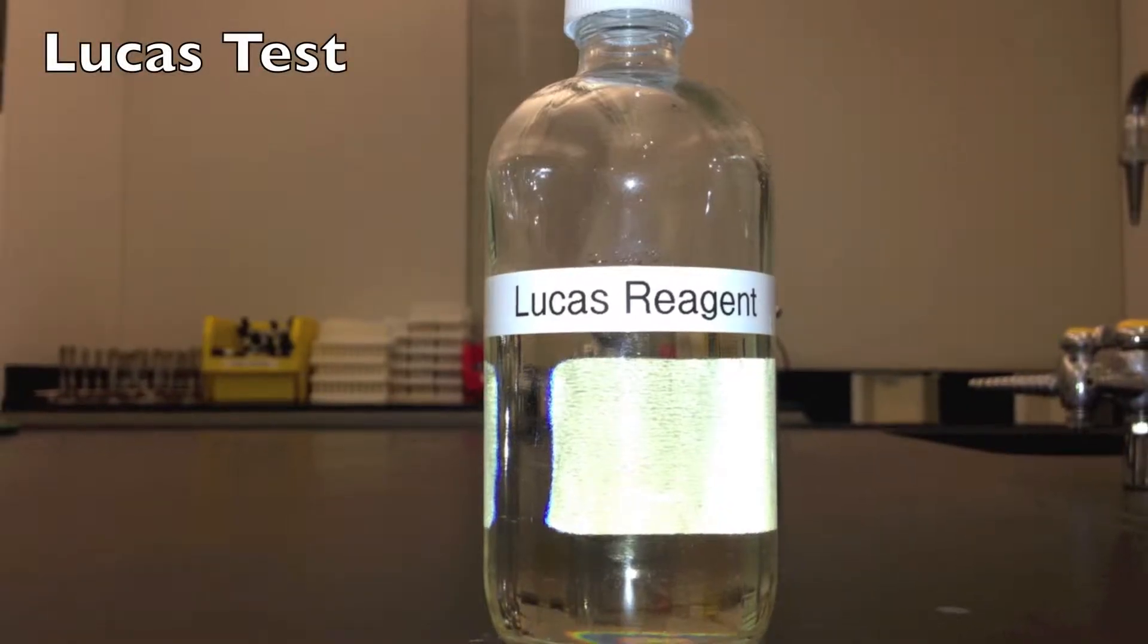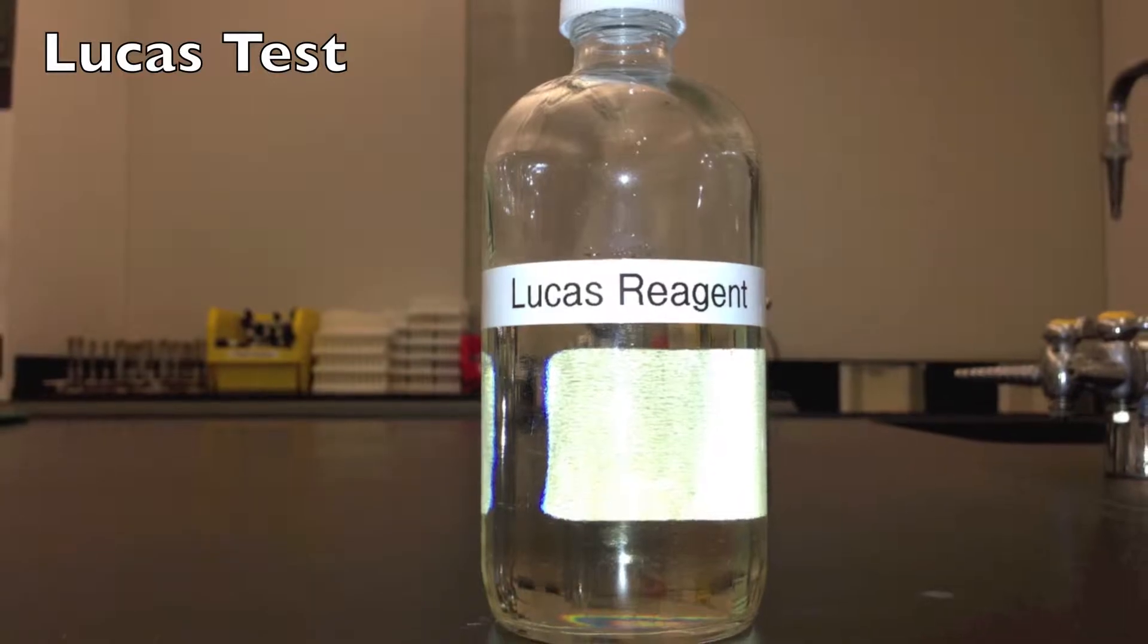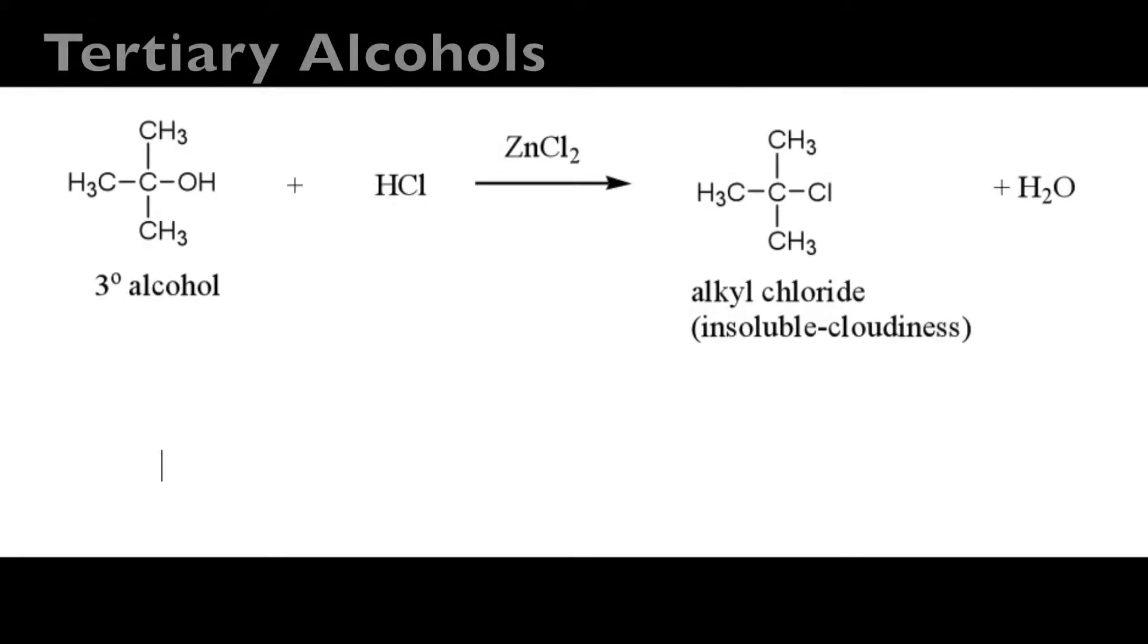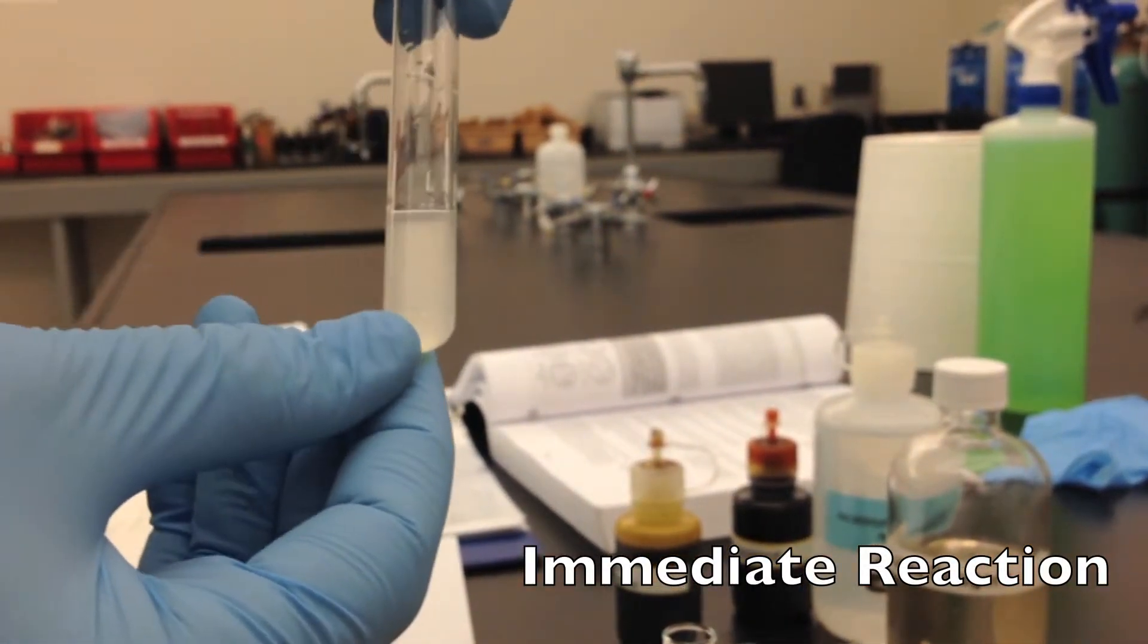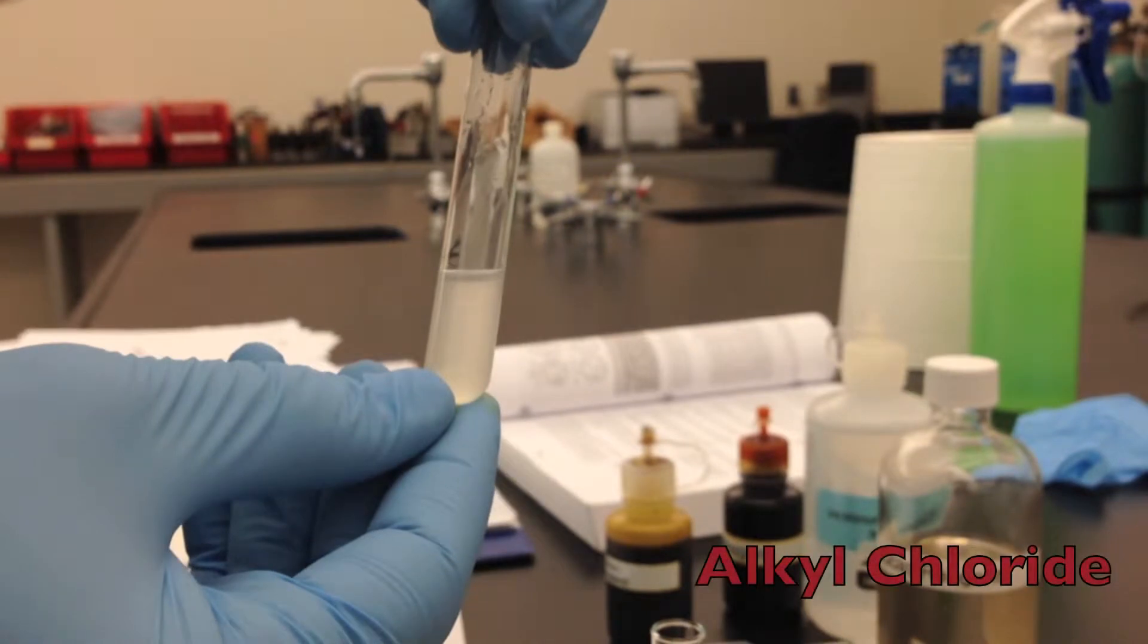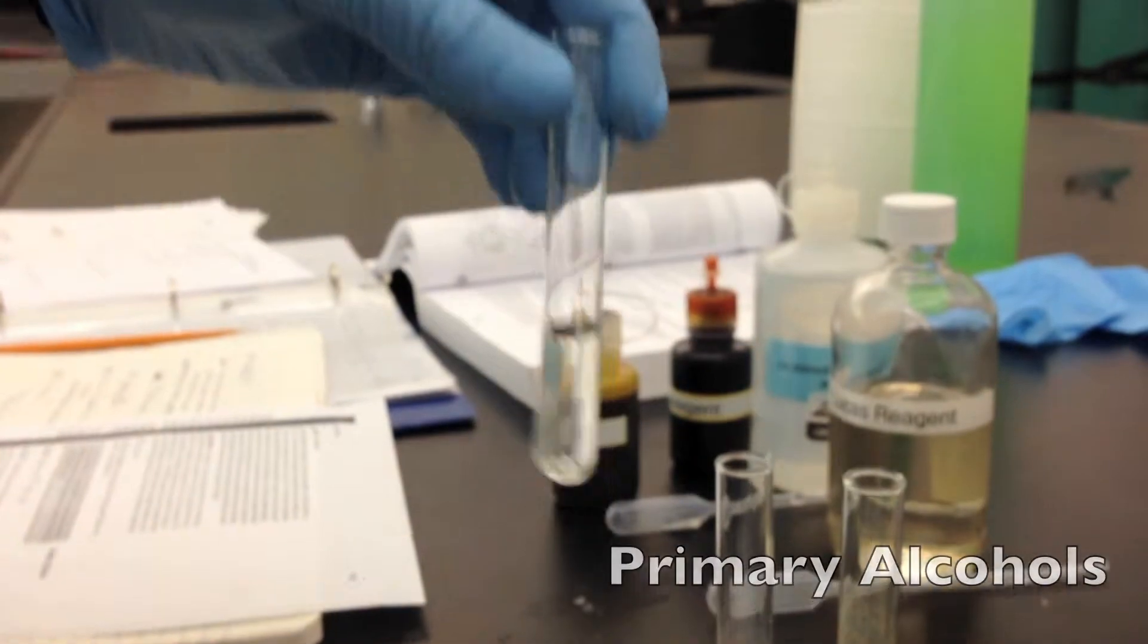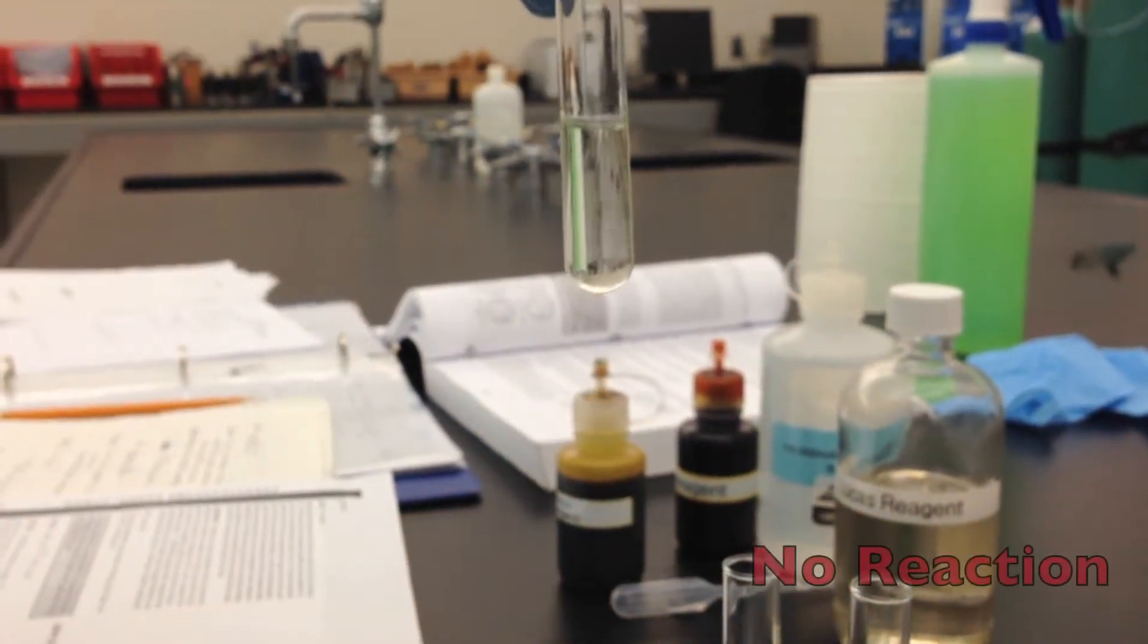Now this is the Lucas test. Tertiary alcohols that are soluble in the Lucas reagent should turn the reagent cloudy almost immediately and soon form a separate layer of alkyl chloride. Secondary alcohols usually turn the clear solution cloudy in three to five minutes and form a distinct layer within 15 minutes. And primary alcohols do not react under these conditions at all.